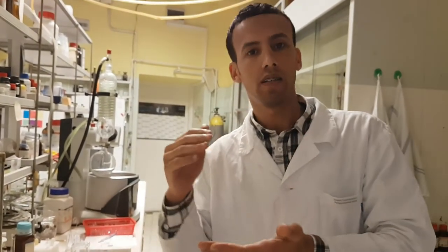After being sure that your reaction is done, we can move on to column chromatography. We use column chromatography to separate our spots, because we will not have one pure molecule; of course, we will have two or three, depending on your structure and the introduction of your reagent into your epoxide. Now we will show you the column chromatography and how it works.